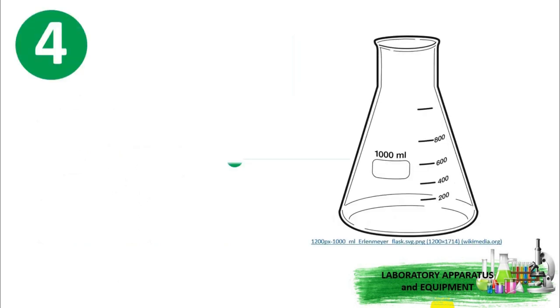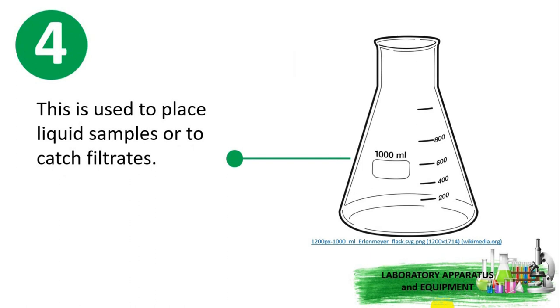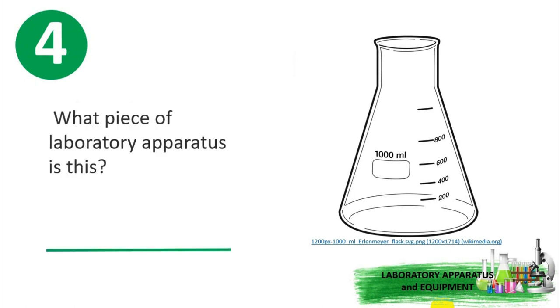4. This apparatus is used to place liquid samples or to catch filtrates. What piece of laboratory apparatus is this?